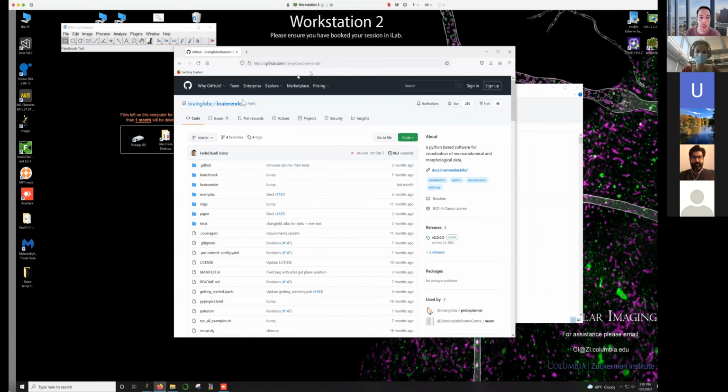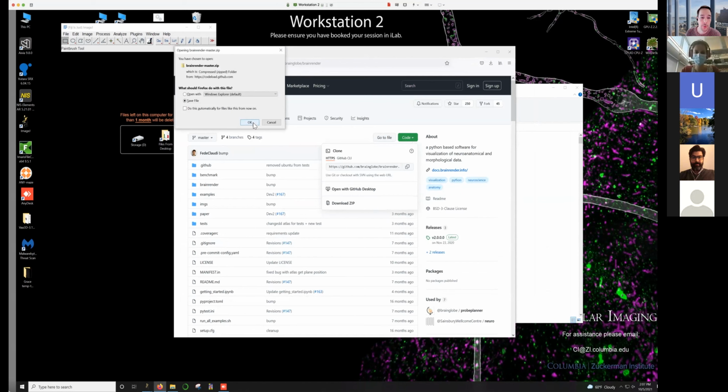So this is the GitHub page for BrainRender, and we can just download the code here. And actually, you should follow along doing this too. So we're going to be going through the data sets that I shared with you, and I have a few extra data sets here on my side, but definitely follow along with all these steps so you can really get the hang of this.